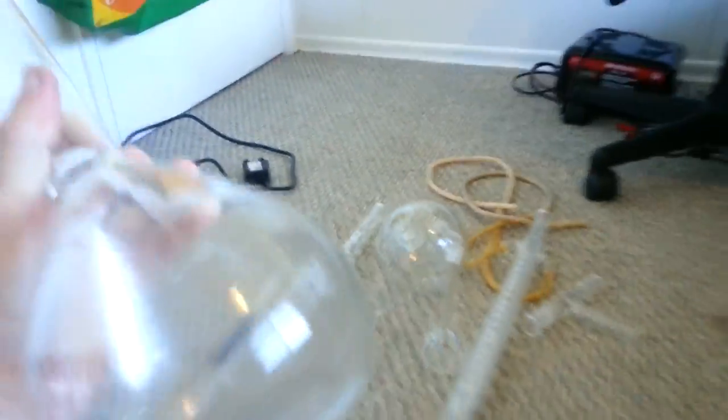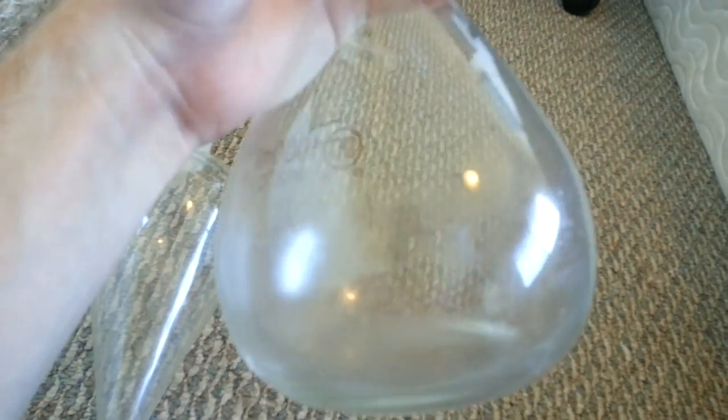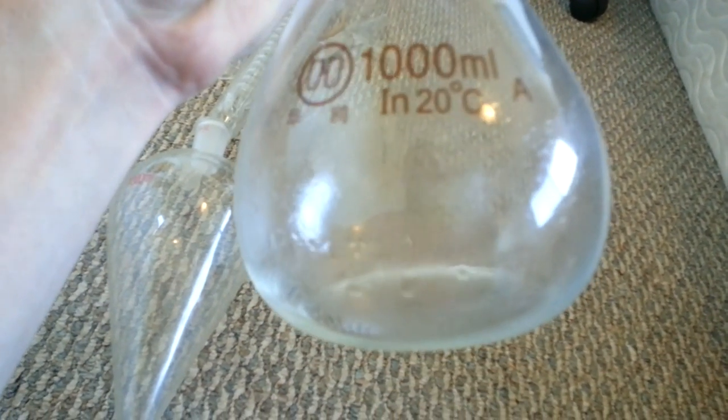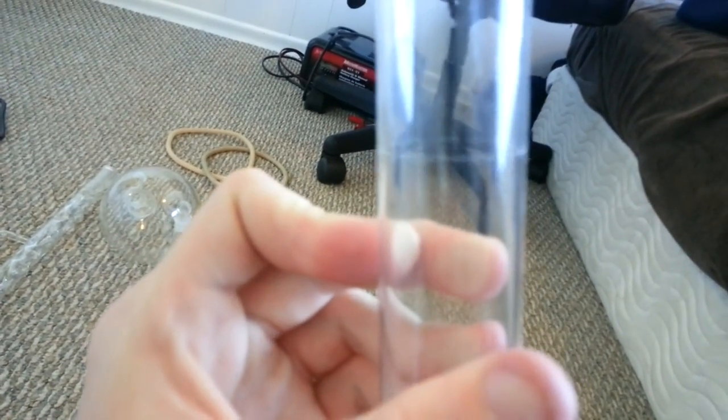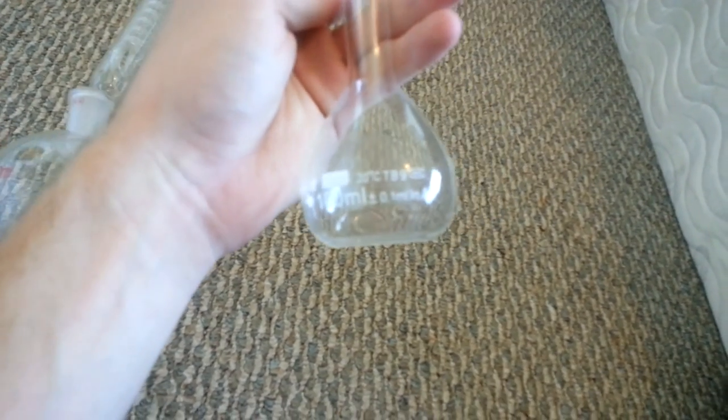Get some volumetric flasks for measuring stuff out really accurately. This is 1000 milliliters — you fill it up to that little line right there, and it gives you a really accurate way of measuring how much liquid is in something. It's also got a little top. I also have a 100 milliliter one right here — 100 milliliters plus or minus 0.1 milliliters. Get a couple of those — good to have.